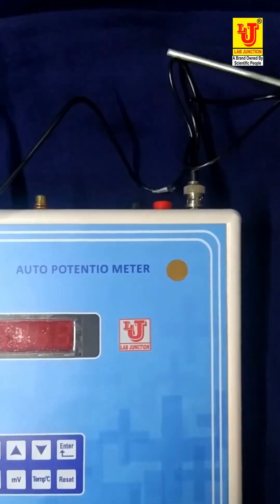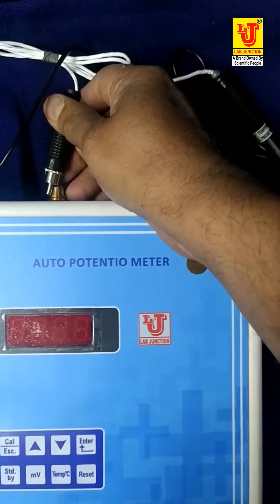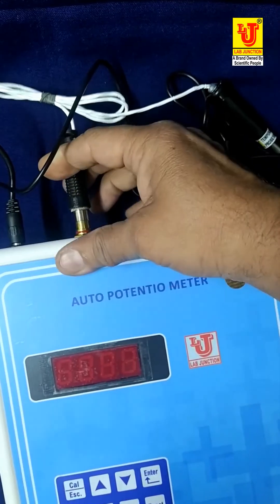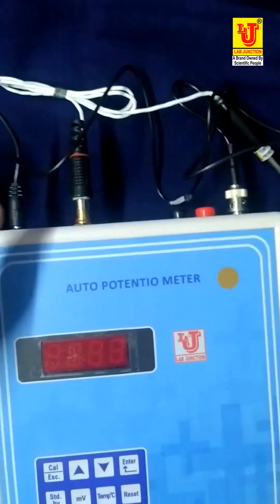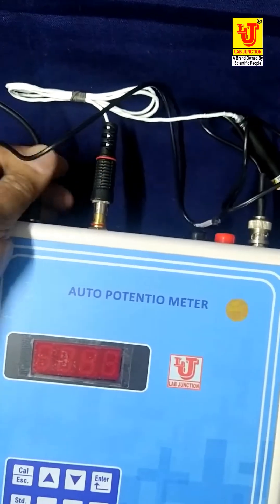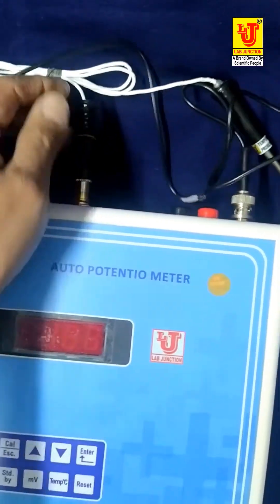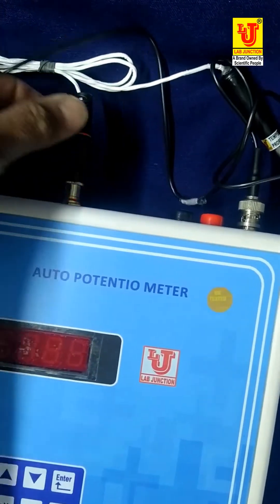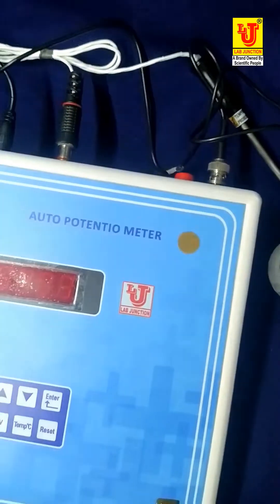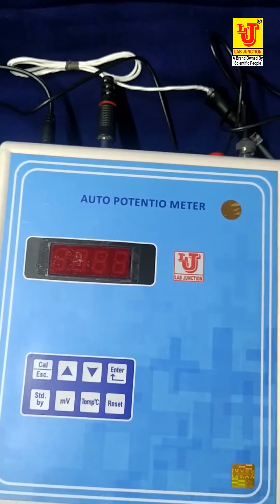Same also with this — this is the temperature sensor. You have to insert it like this only. Insert like this. Now switch on the instrument.